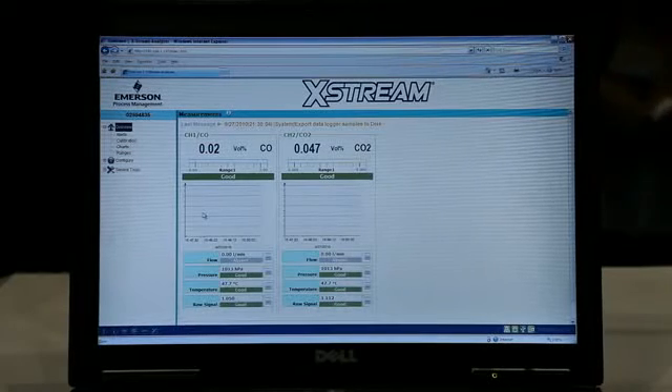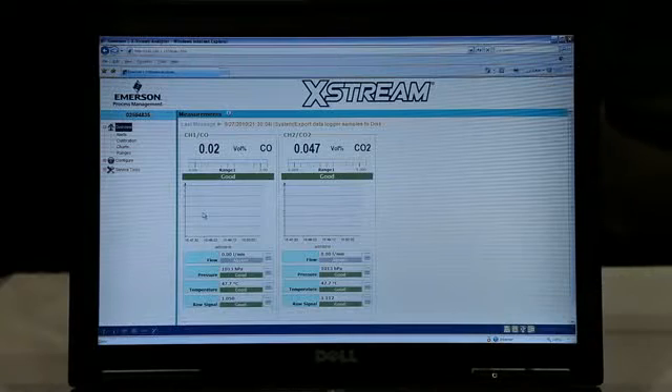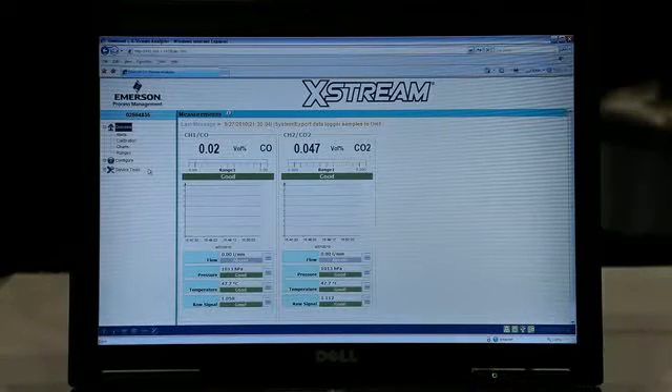Utilizing a standard web browser, we're communicating with the X-STREAM XE process gas analyzer. Here we have the overview screen. As you can see, we have drop-down menus here to configure and perform service remotely at any time from anywhere.